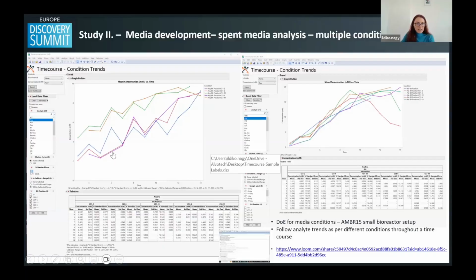We can see here that values are missing at specific days, like here and here, day 11 and day 6. And we also can see that in the data table, like missing values. This means a bug which can be reported to 908 Devices. It's still ongoing to investigate what happened.